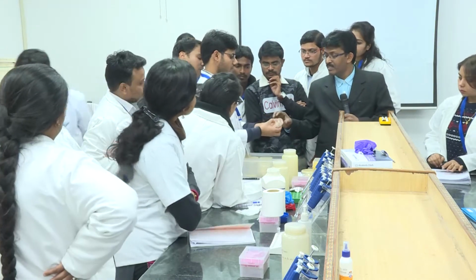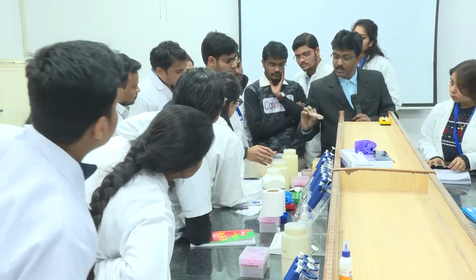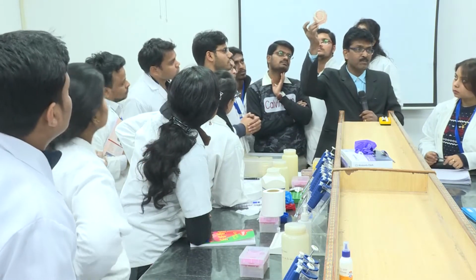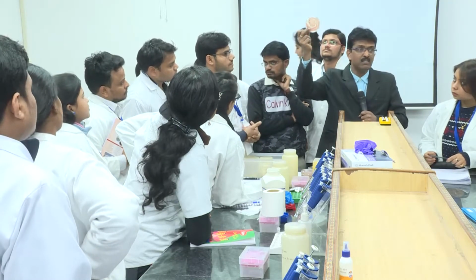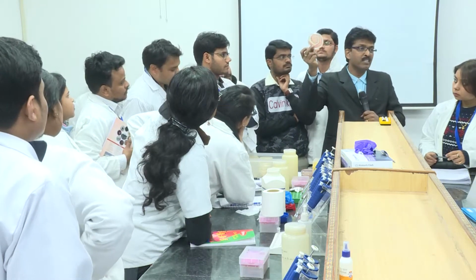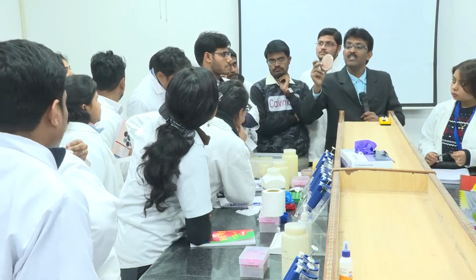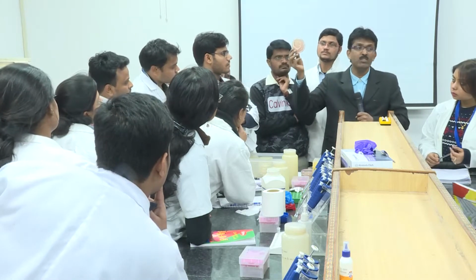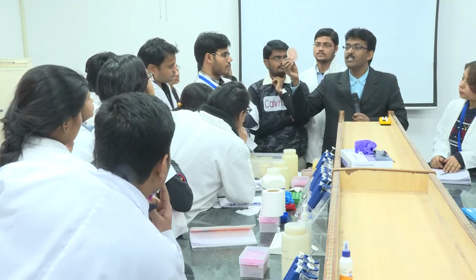So how many of you? What is this? This is Pseudomonas. Why is it red in color? The media is added with a chemical called 2,3,5-triphenyl tetrazolium chloride. This is converted into an insoluble formazan, and this formazan is trapped in the bacterial cytoplasm.